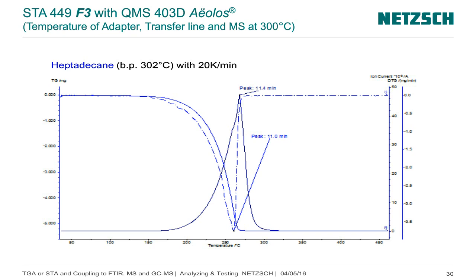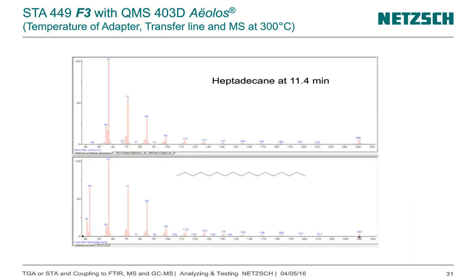For the data which you have in the mass spectrometer, I take here the data after 11.4 minutes and compared it with this database, and this fits well. So it's also possible to detect the substances, and this works without any problems, but I think everybody will also expect that it works.